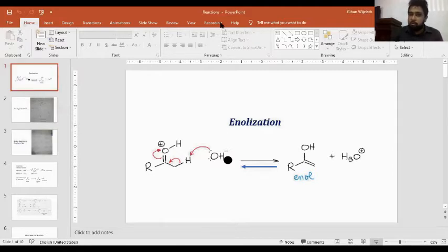Okay. So I think now you might have a question: in Fehling's test, there's a redox reaction. Then what will reduce and what will oxidize? What do you know about that? That's a redox reaction because there is a reducing sugar, and on the other hand, Fehling solution is a mild oxidizing agent. There's a reducing agent as well as an oxidizing agent. And what will reduce?